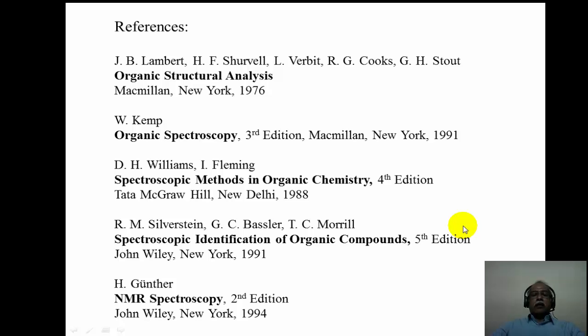So what we have seen here are a few examples of identifying stereochemistry, particularly cis-trans isomer stereochemistry, diastereomeric isomer stereochemistry, or conformational isomers using the NMR spectroscopic technique. We have used in some cases the delta value or the chemical shift value to distinguish the stereoisomers. In some other cases, a few examples are also shown where J values, namely the vicinal coupling information, are used as the tool for identifying the relative stereochemistry of organic molecules.